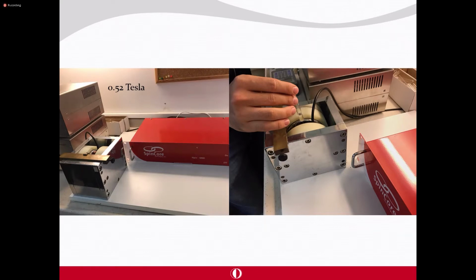So you see we have switched from 3 to 5 mm to 10 mm, which is giving us a lot of flexibility in terms of working with foods. And then you put your sample into that radio frequency coil, and then you start your spectrometer. It sends the RF pulse, your sample is excited, and then the RF pulse stops, and we obtain a signal, and then we analyze the signal.